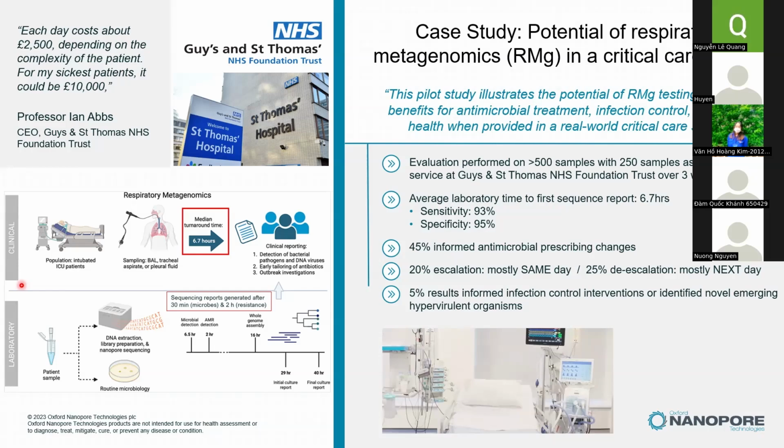In the QC step, if I use some kind of kit for size selection, should I use TapeStation or Bioanalyzer to QC the sample again?